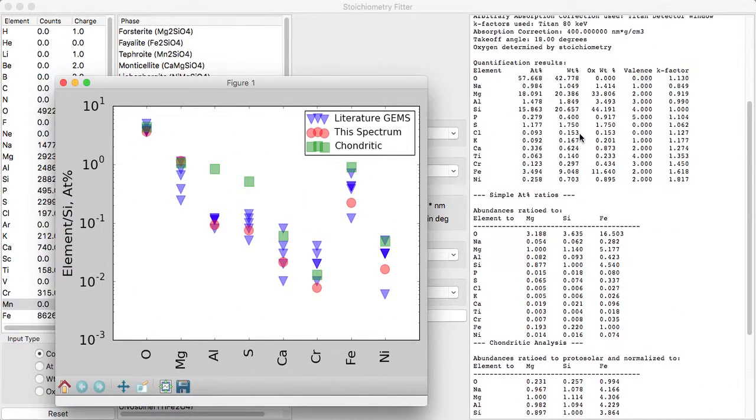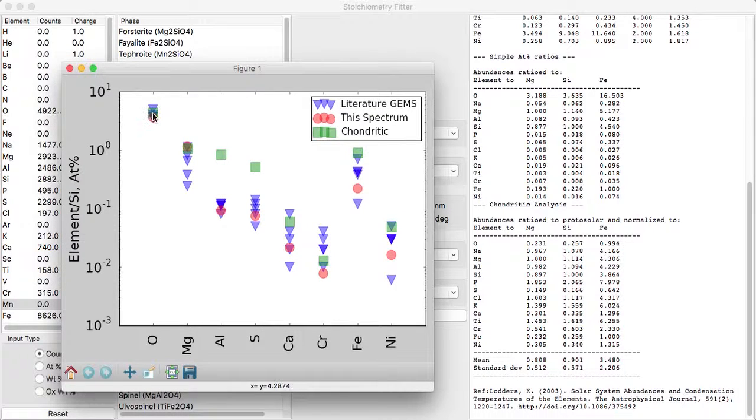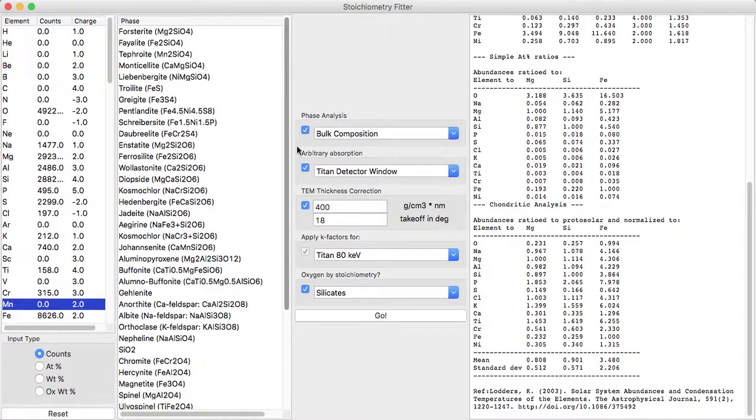So here it's computed elements ratio to the average abundance of elements in our solar system. Here it gives a reference for it. And then you've got a plot here. The red is the data from this spectrum, and then the blue is a certain type of astromaterial, and the green is another kind of astromaterial. And so you can see, you can do fancy analyses. All right, that's a quick overview.